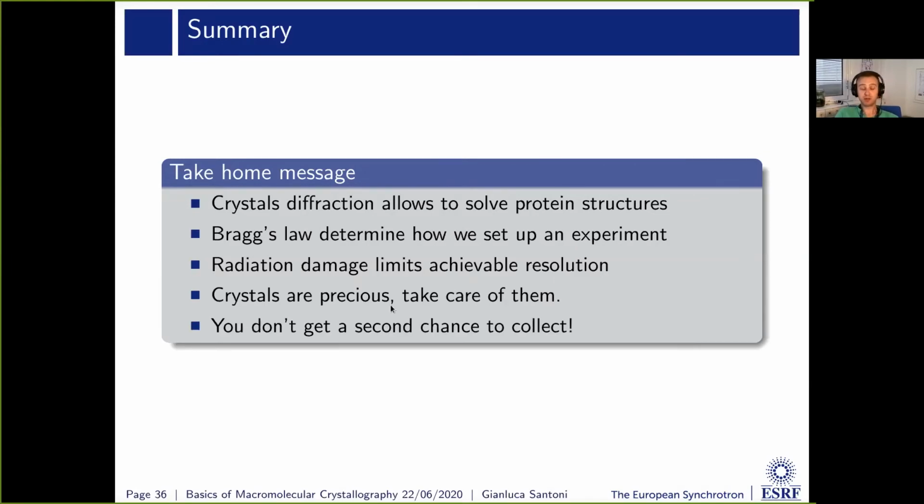So, it's important to remember that you don't get a second chance to collect data from a crystal. In general, the first few images have already damaged the crystal, so your crystal will never be the same if you collect data twice from it.